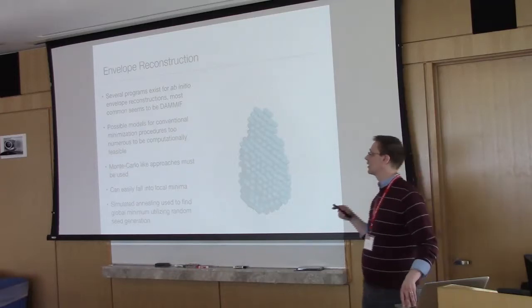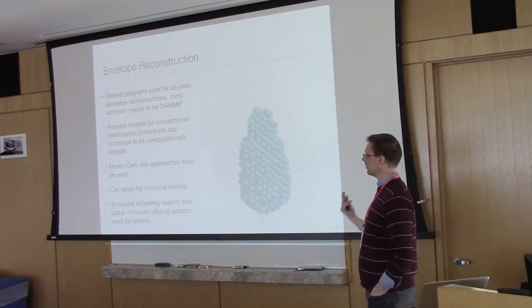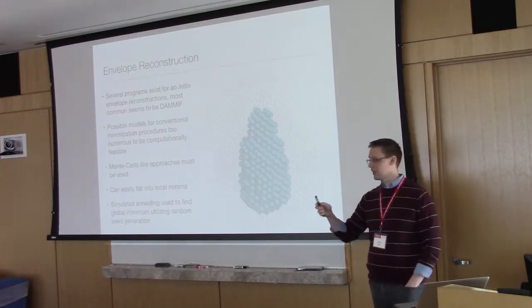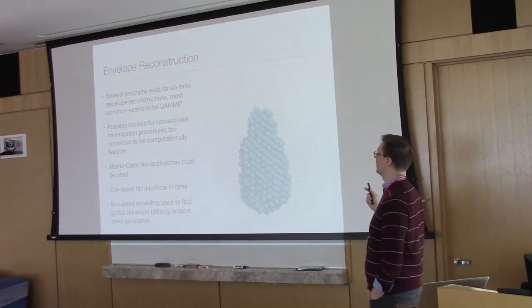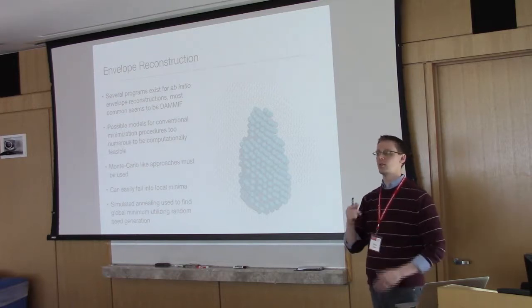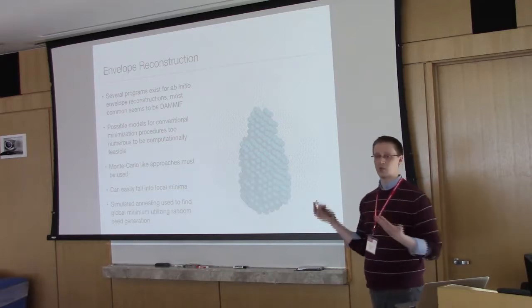Okay, so let's start with envelope reconstruction. One of the things that you'll do initially when you go through tutorials tomorrow in terms of shape reconstructions with bead modeling, or a lot of the different modeling tools, is you'll go into Primus or into RAW, and you'll run GNOM or BIFT or something to calculate the pair distribution function.